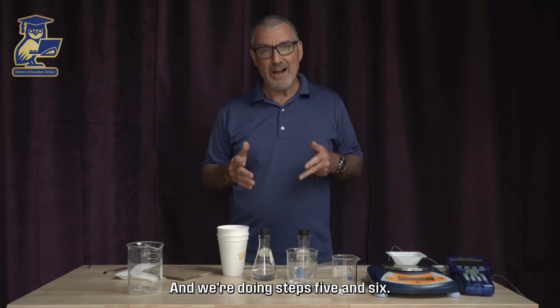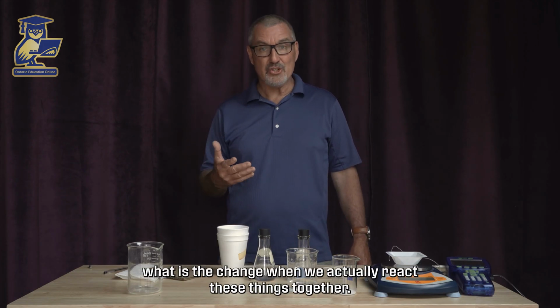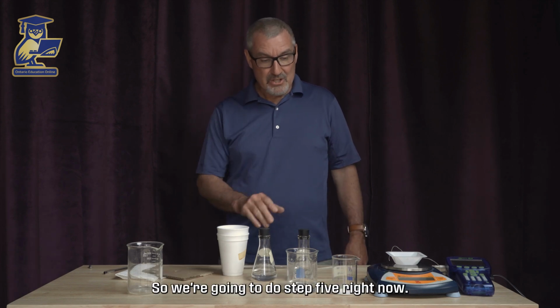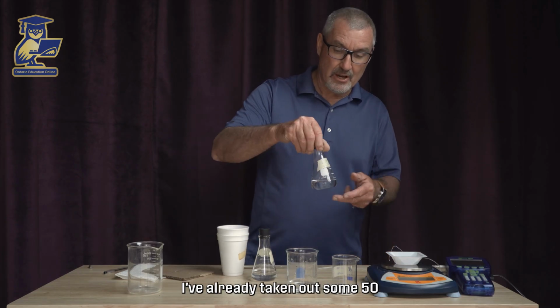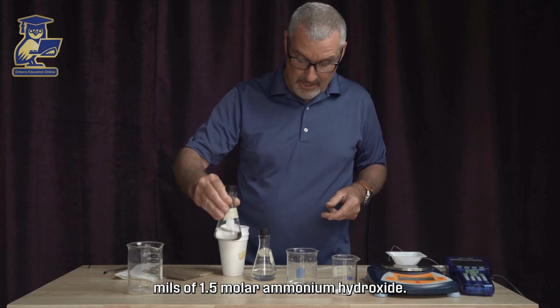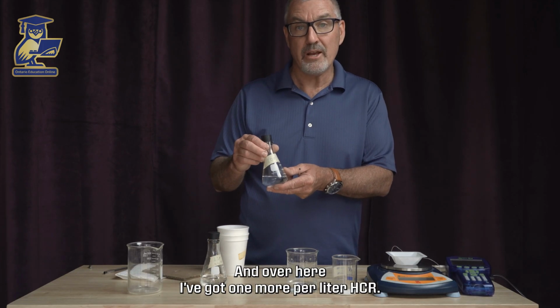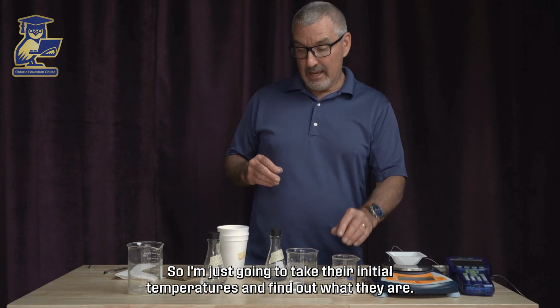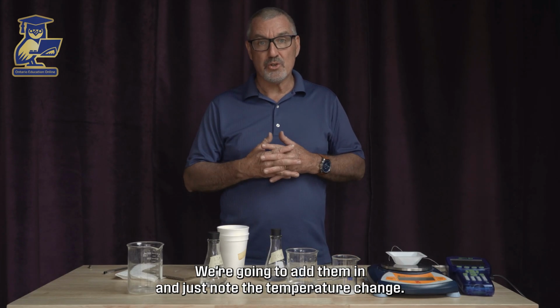And we're doing steps 5 and 6. 5 and 6 are going to be what is the change when we actually react these things together. So we're going to do step 5 right now. I've already taken out some 50 mils of 1.5 molar ammonium hydroxide, and over here I've got 1 mole per liter HCl. So I'm just going to take their initial temperatures and find out what they are. We're going to add them in and just note the temperature change.